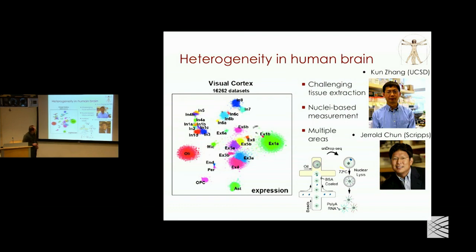The technique for the actual RNA expression measurement is essentially Drop-seq, but it's a nuclei Drop-seq. The reason it's nuclei is that brain tissue, and neurons especially, is very difficult to dissociate in a viable condition. So you're better off extracting nuclei, breaking down the cells, and just working with the nuclei. Now, obviously, you get only the nuclear transcriptome, which can be limiting, and we did some studies comparing them, but it's difficult to generalize across different cell types. That might be a little confusing.